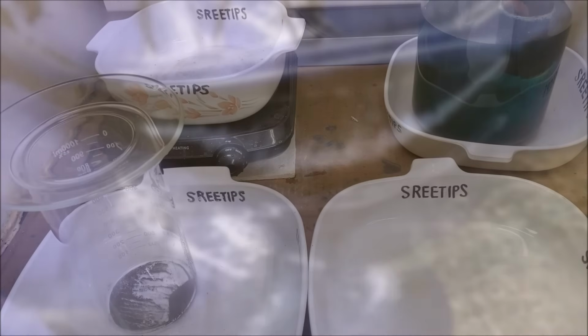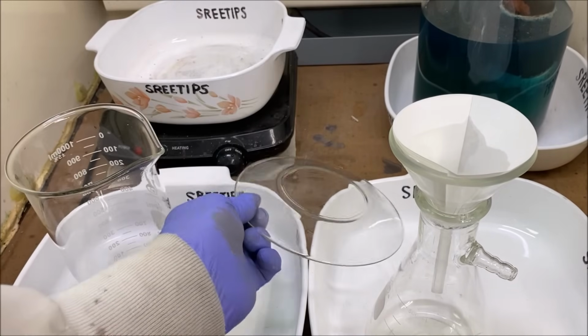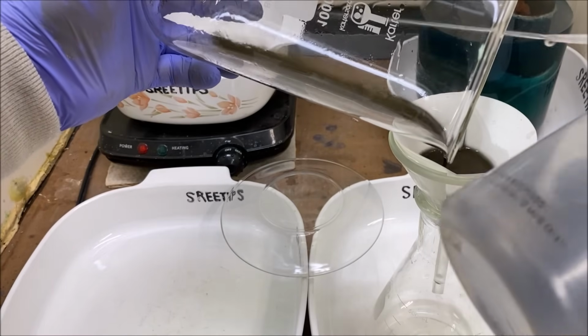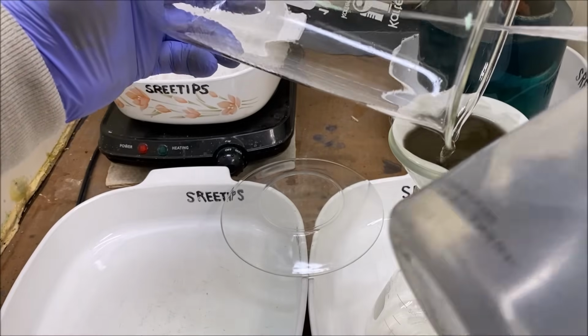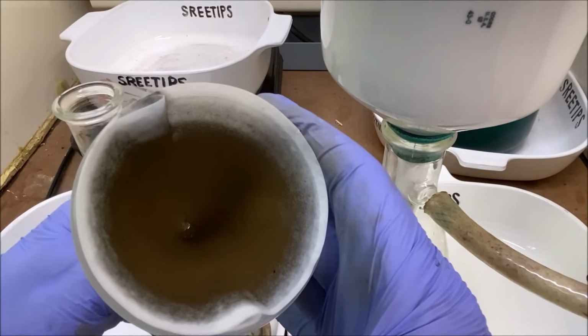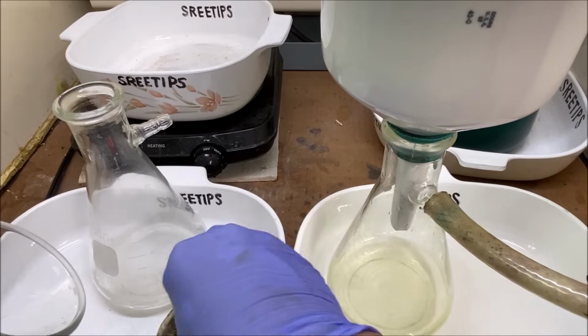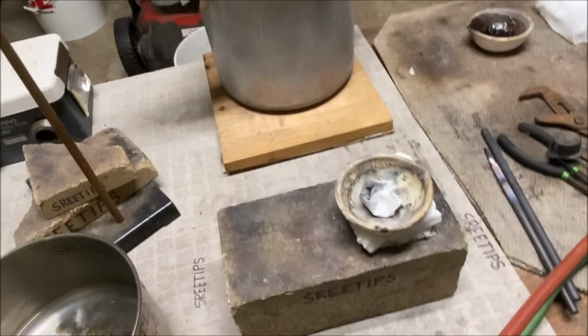Gold down in our beaker. Looks like a small bead of it. Not bad. Now let's collect the gold in a filter. It's not very much. Here's the gold down in our filter. Isn't very much. Put it in this melt dish. Now let's take it over here to the melt table. See if we can melt this up a little bead or a button.